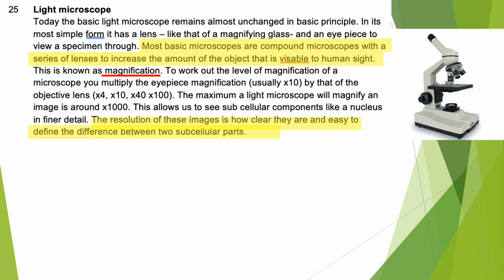Whenever you look at a picture of a cell or anything like that, most likely when you publish it in a work, it will have something called total magnification. When we're talking about magnification, we generally have to put it on there because if you have a picture of something and it's kind of hard to tell what it is, it helps to put that magnification so that when scientists look at it, they know, well, this is at 400 times magnification, so we know that it has to be extremely small.